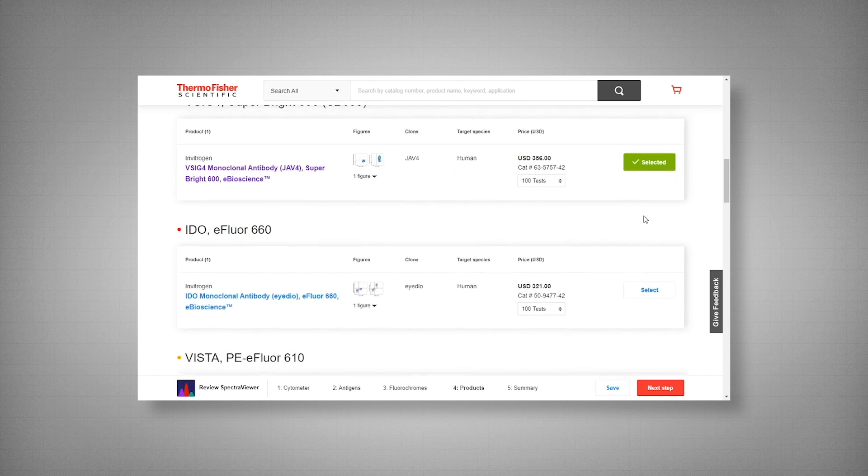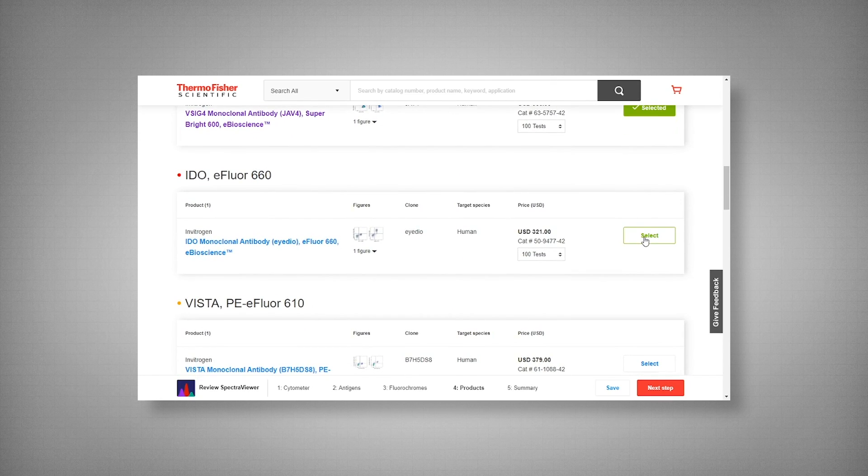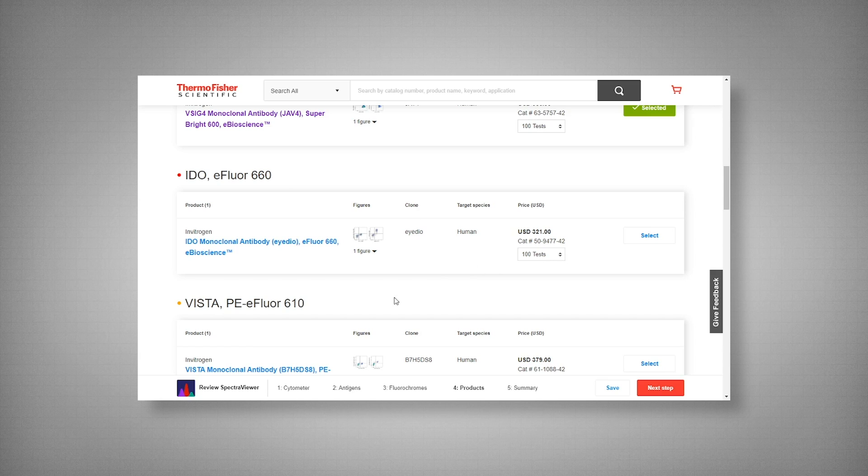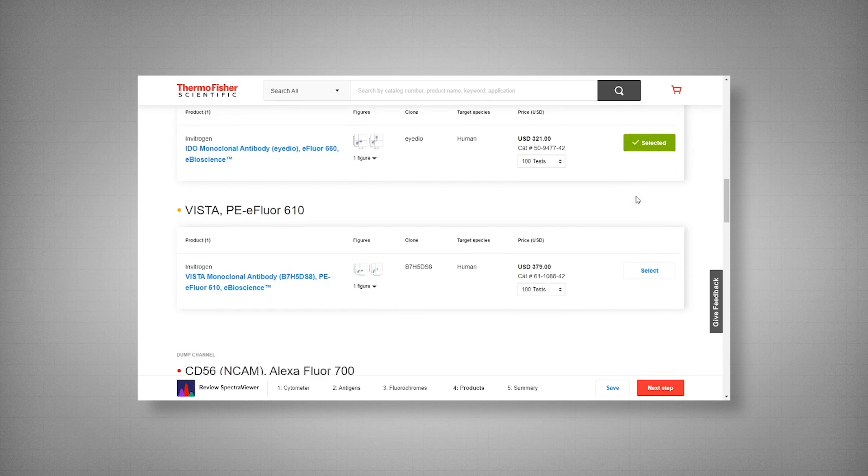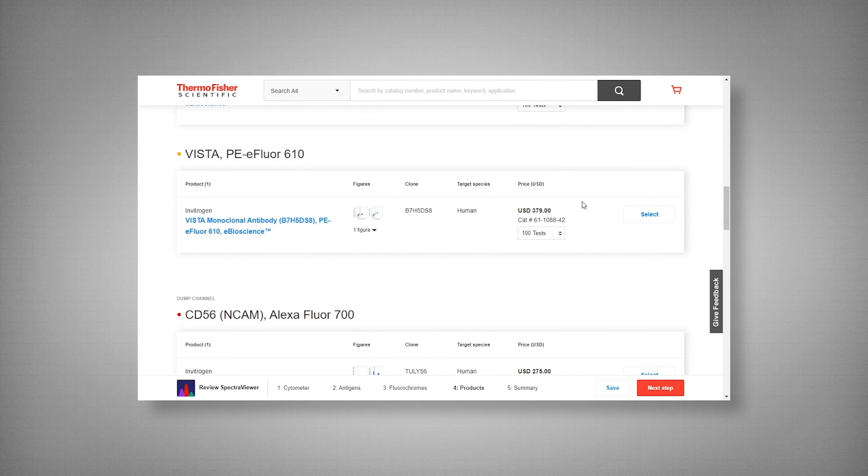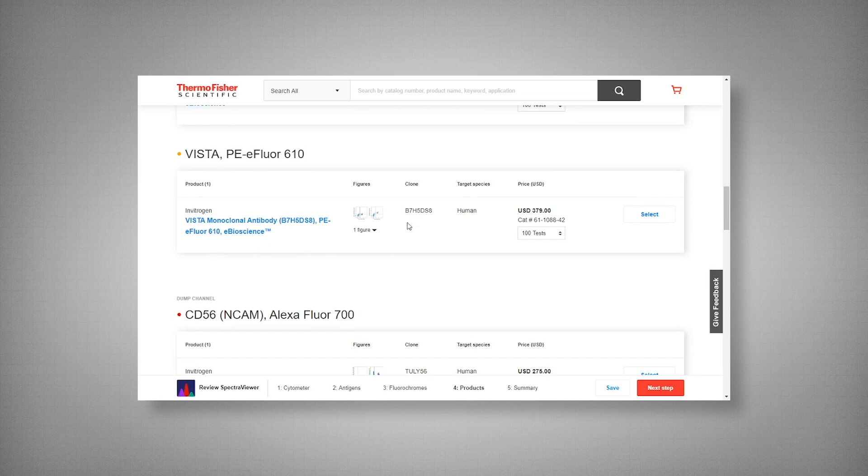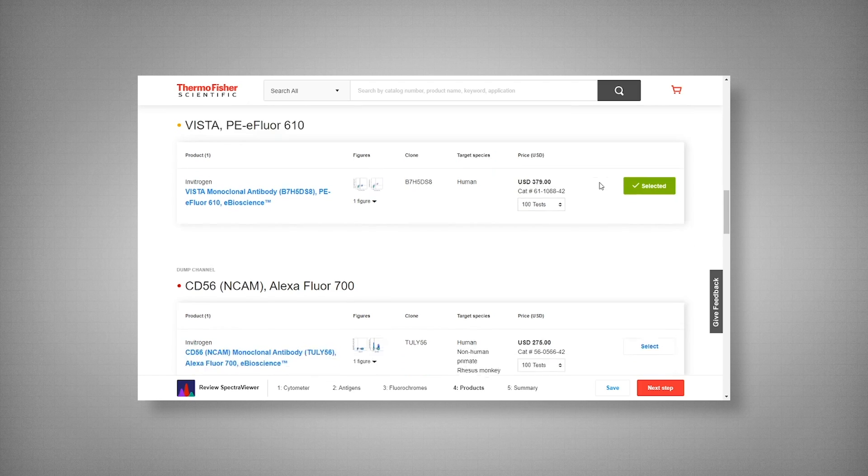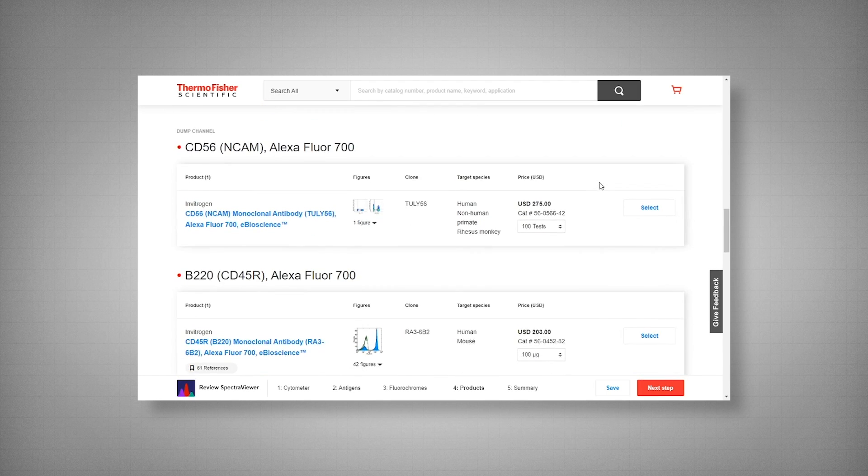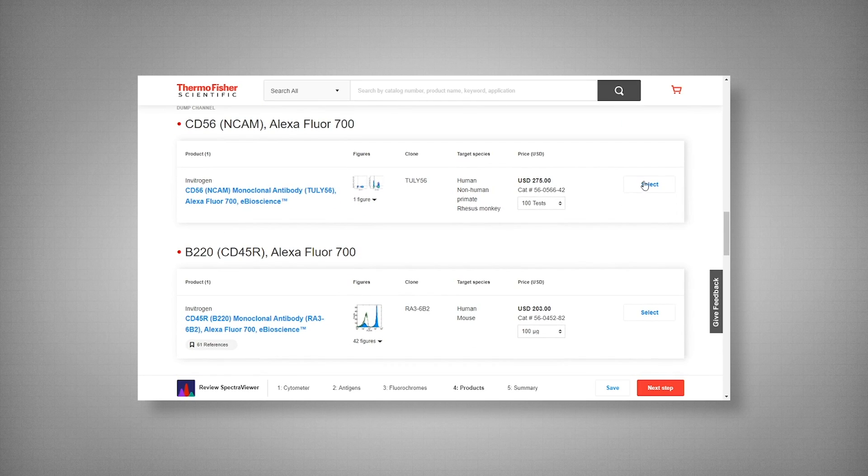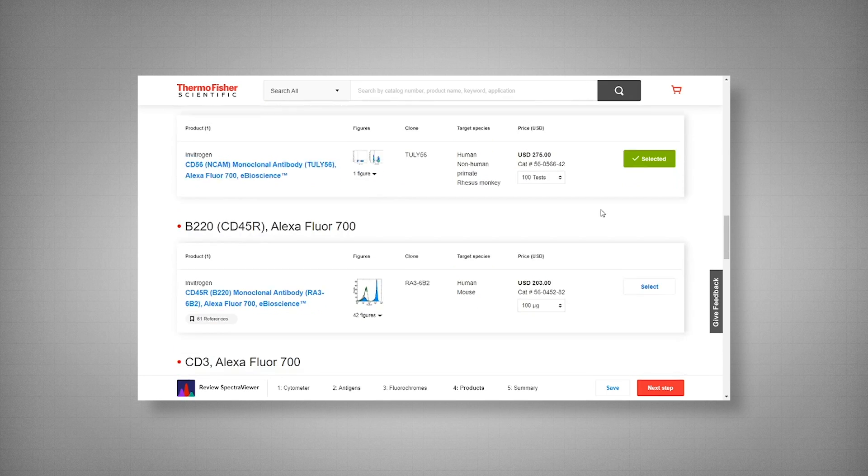Okay, now we have our VSIG. Our IDO, which I think the clone name IDO being a play on the actual target. Again, these are fun little facts. And here we have Vista again, another play on words with our clone name and our target. Vista being part of the B7 family, we have the clone name B7H5.